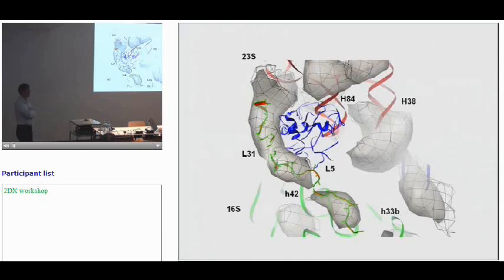Now, the other question is, at the given point, we do the sampling along the star to get the L. And each of those, of course, is the correlative measurement of many, many points along the lattice line. And each point there has a certain sigma, but the value we actually stick in with the CCP4 wasn't the sigma then, because it's the result of many measurements. Just take the one which happens to be where you sample.